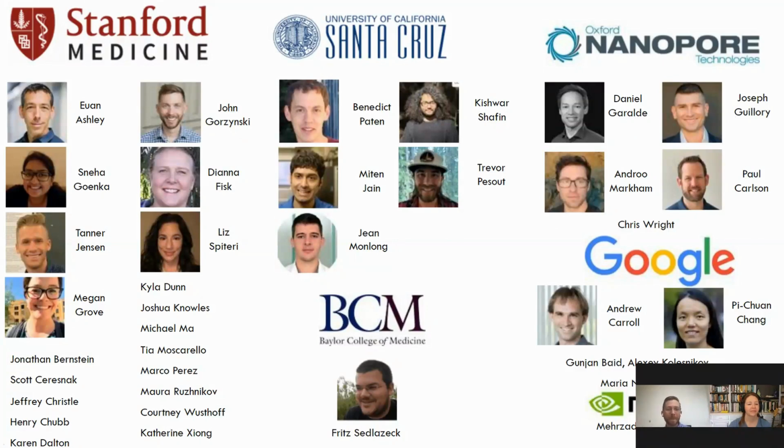Yeah. Great. Next question. Can this be applied to cancer diagnostics? Also, yeah, another great question. Certainly, this can be applied to cancer diagnostics. The thing is, we would need to probably start thinking about different biological tissues that we're extracting DNA from.